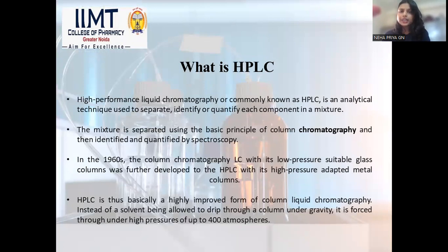So basically, HPLC is an analytical technique used to separate, identify or quantify each component in a mixture. First we need to understand what a mixture is. A mixture consists of two or more substances within it. For example, if I have a mixture C, then A and B are present as constituents in that mixture, and these two when combined together form the mixture C.